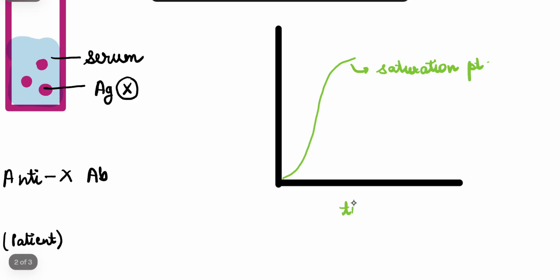This is just, for the time being, with time, and this is, let's say, the absorbance, or the color produced.